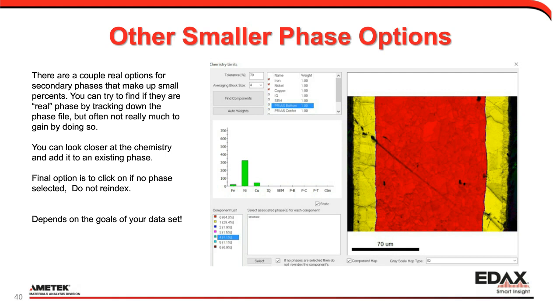But now let's look at the map on the right. Where are those green pixels? You really can't see them because they're relatively sparse. They're not grouped in any large grain. So it might not be worth adding. Is it really going to tell you anything about your sample? It may or may not. So, if it is, go ahead and find it, track it down, and reindex it. If it doesn't matter, just don't reindex it.